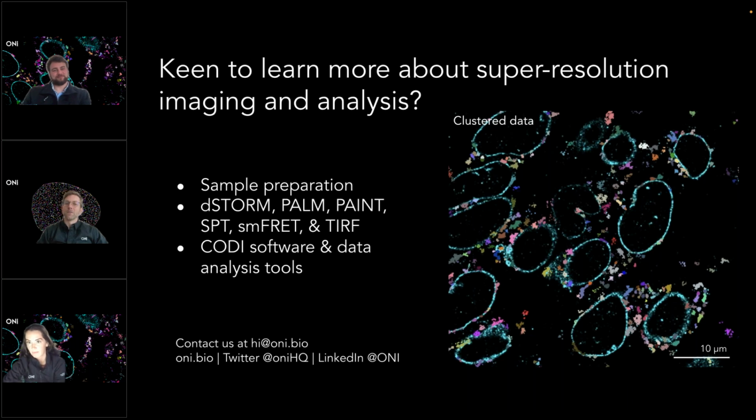So that's the EV profiler tool that Marcus showed you earlier, and then I showed you some data from earlier. Essentially, for a given cluster at a certain radius around it, it's going to be able to count the different number of localizations in each channel, right? So our counting tool in our clustering algorithm works really well for that.